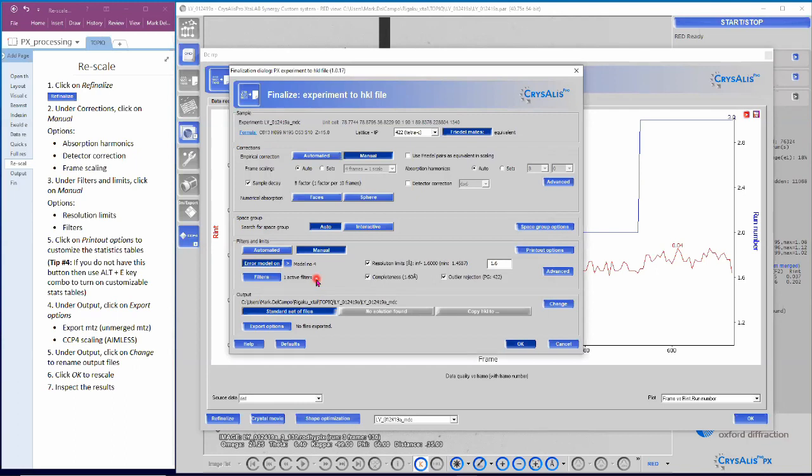That's the filter I use most often, the rint filter. There's another filter in there for excluding certain frames from certain runs, and that's another one that I would use.